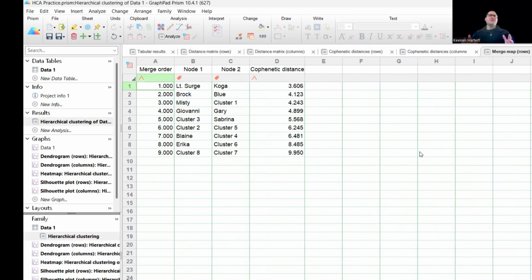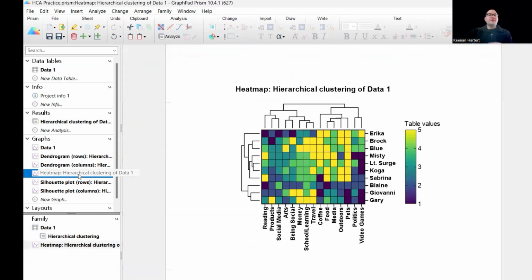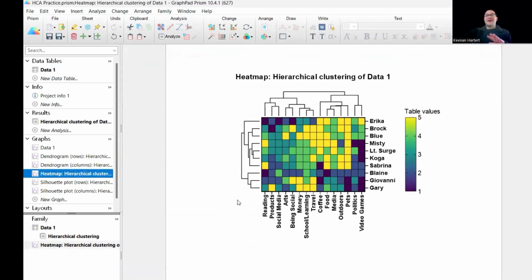This is a new capability of Prism. It fits really well with the multivariable setup. Again, it takes some moves. Like I said, make sure that you have a title set up with your labels, because some pieces use the labels, some use the title. Perfect. But otherwise, you are looking at making a lot of sense out of a lot of data.